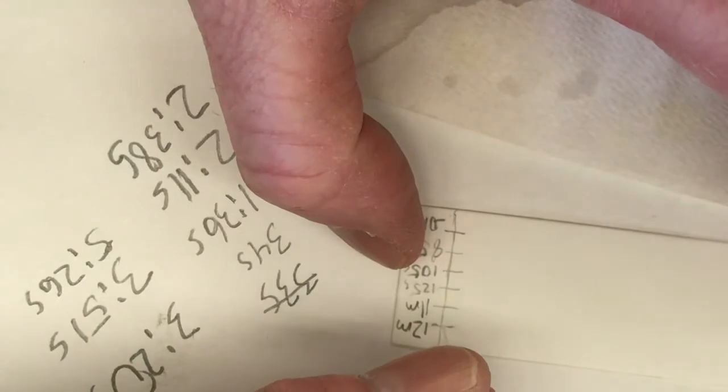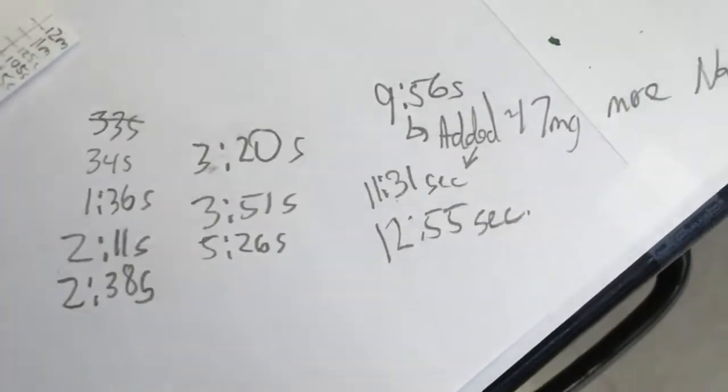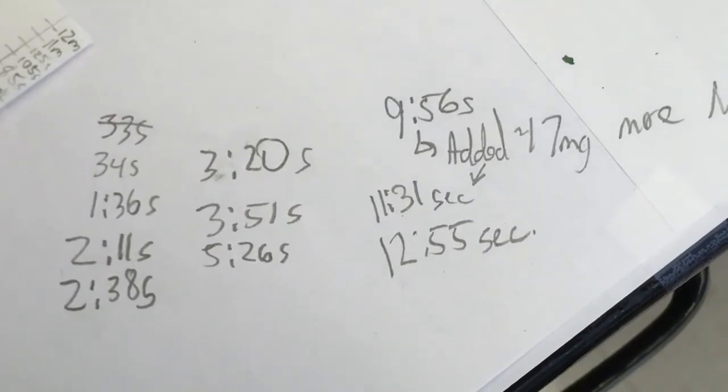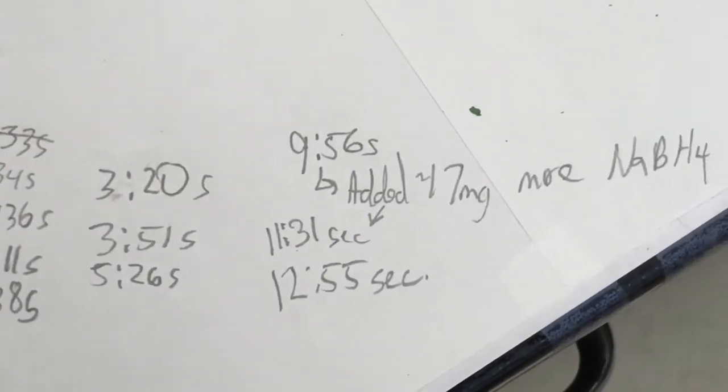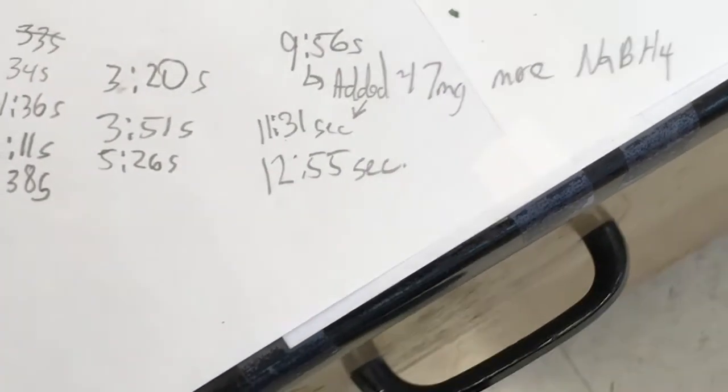Okay, drain it off, and I'm going to spot at the 12-minute mark, where I have it labeled as 12, but it is actually 12:55. Okay, that's the final one, and so there's my timing data, and I'll put it in the Google Doc in a more readable, understandable order. And now I will let this stir a little bit while I get the other spots ready.